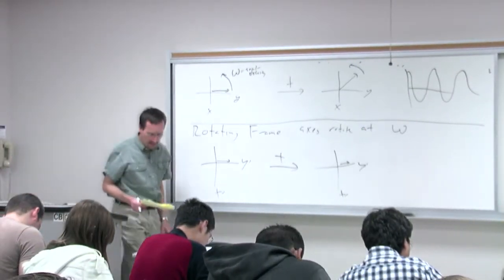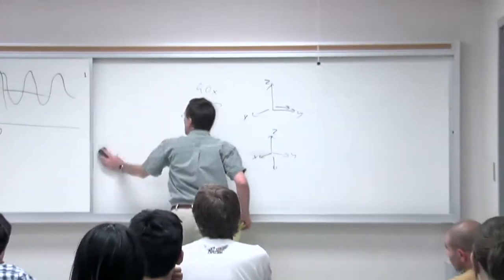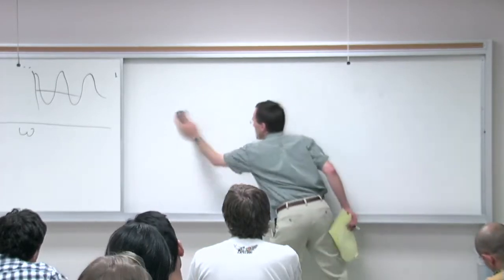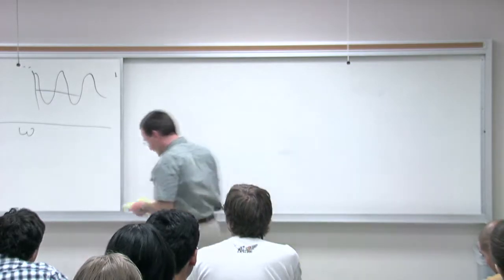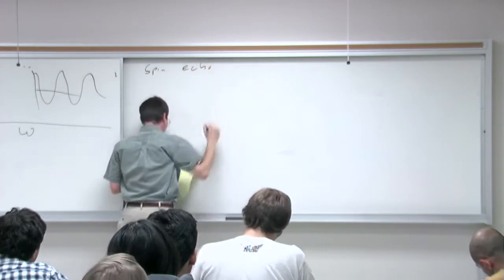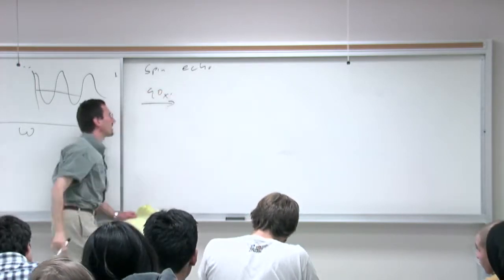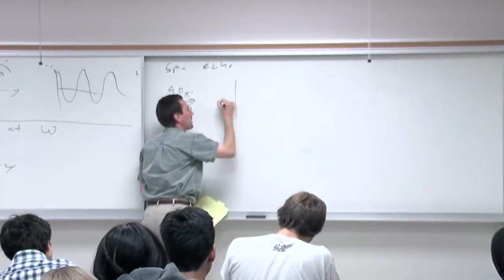All right, now we're ready to introduce the concept of the spin echo. And that's going to be the basis for differentiating our quats and methylenes from our methynes and methyls in the DEPT experiment. Okay, so the idea behind the spin echo is as follows. We're going to be in the rotating frame, and so we start with a 90-degree pulse, and I'll call it a 90-degree x prime pulse just to show that we're working in the rotating frame.